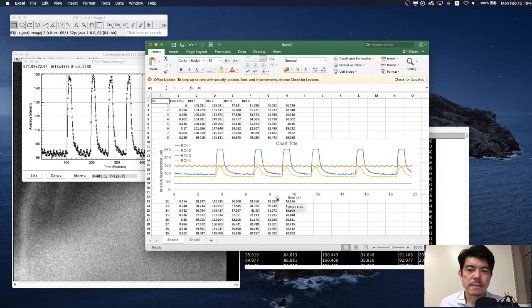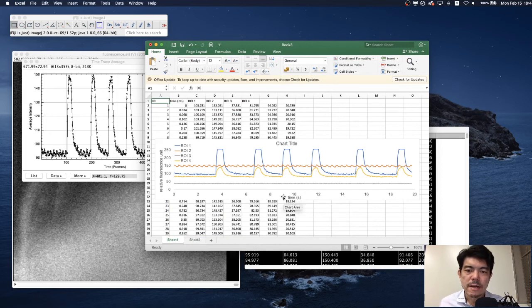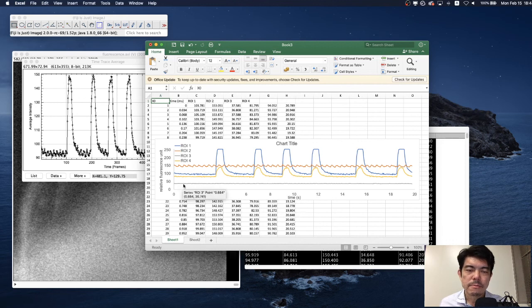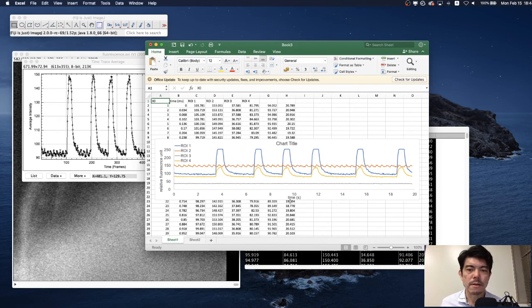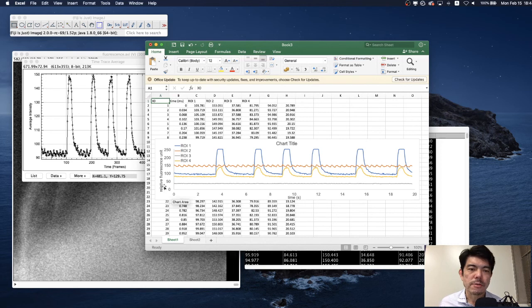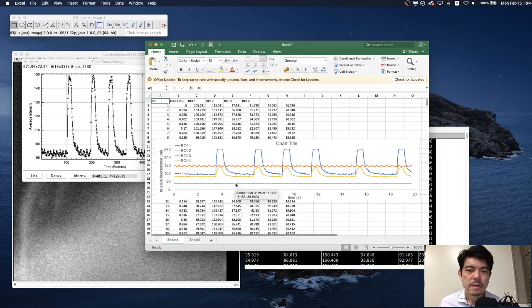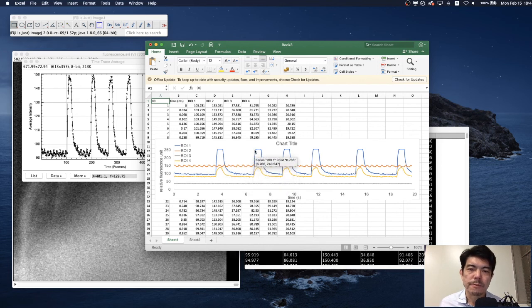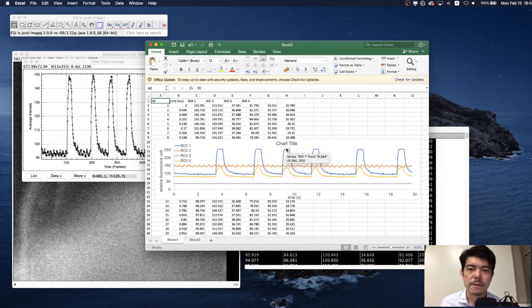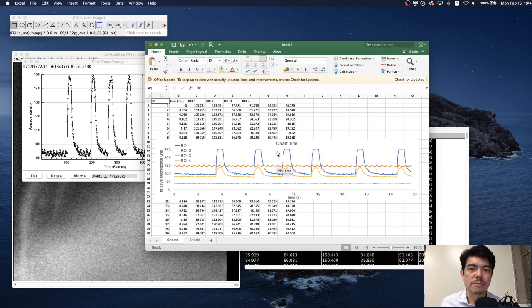And this is the final result. I added the horizontal axis label and vertical axis label. It's always important to add the title for the axis like time in seconds and the relative fluorescence unit. And here we have the horizontal axis label. And here we have the nice quantitative result of the fluctuation of intracellular calcium level.